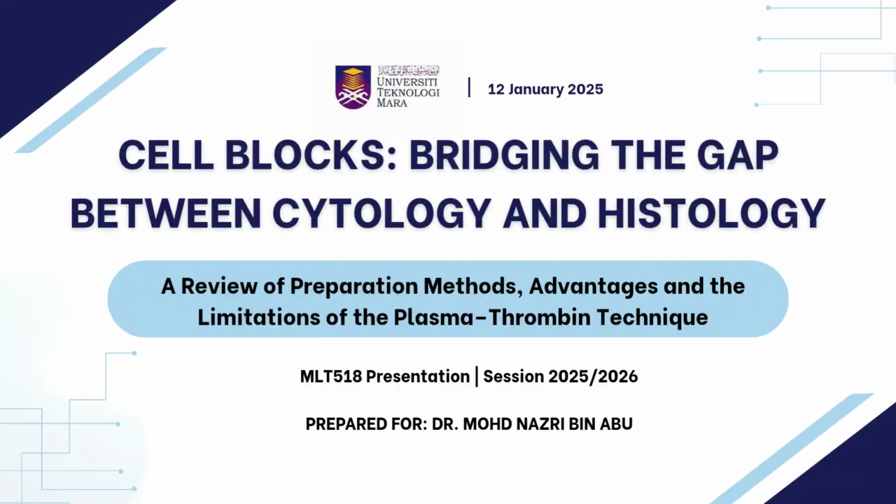Hi everyone, in this video we will discuss a critical topic in pathology: cell block, bridging the gap between cytology and histology. Our video will be focused on the preparation method, advantages and limitations of the plasma thrombin technique.